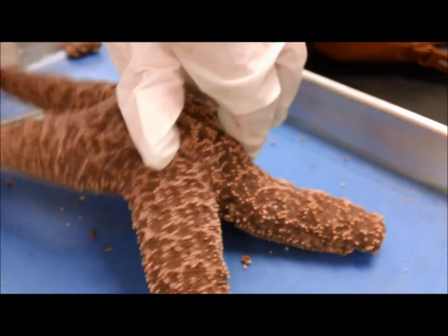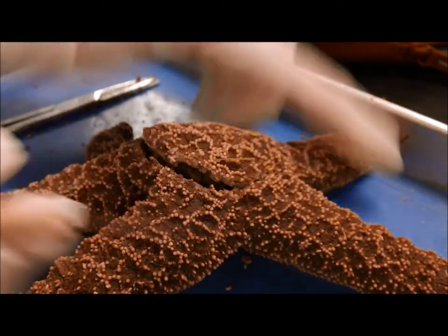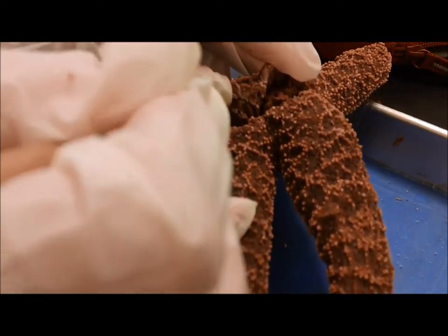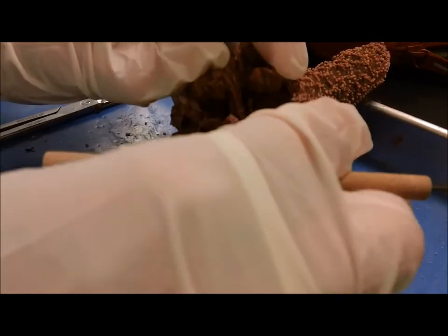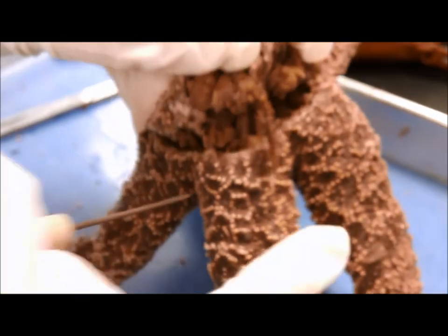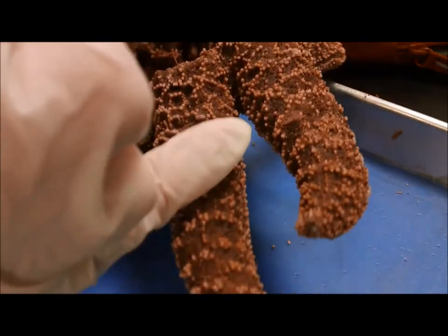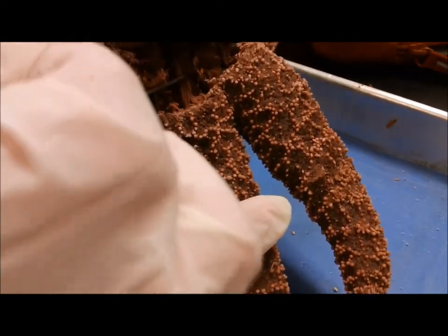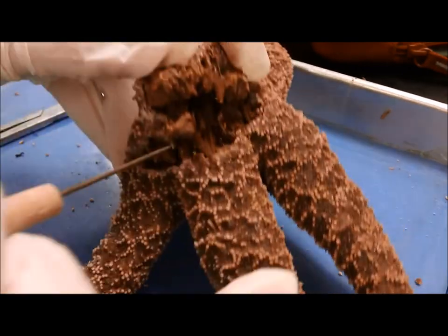The last one was kind of a pain — it did not want to open up. You can see here part of the pyloric cecum and the intestines from the various arms. As I pull this up — the gonads are really defined there. See that? And you can see where the ring canal is coming up here. It's like more gonads — they're just pulling up very easily out of the arms.